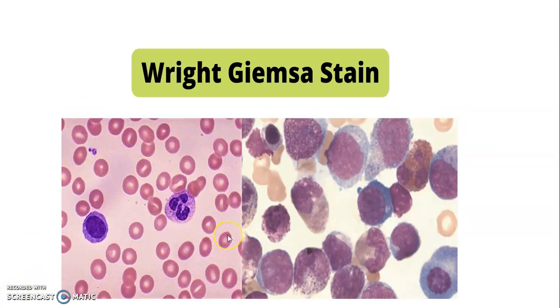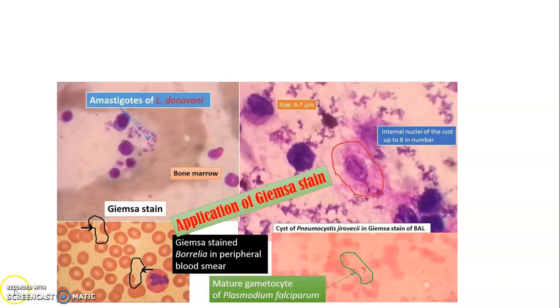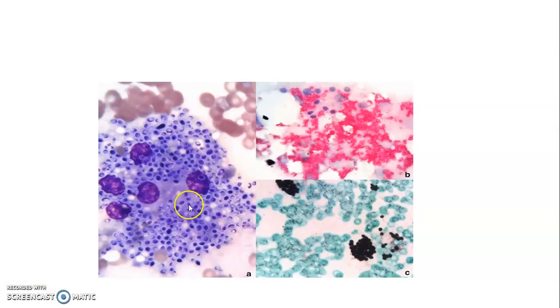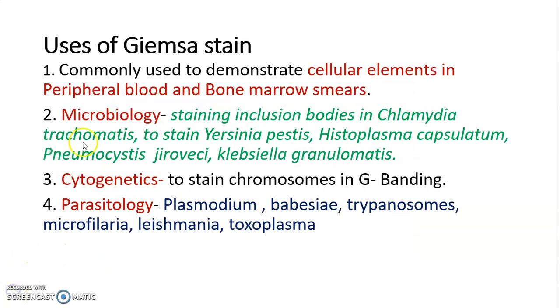Photographs shown here demonstrate Giemsa staining for detection of cellular elements in peripheral blood film and bone marrow. Giemsa stain showing Leishmania donovani, internal nuclei of cysts, Borrelia, and Plasmodium falciparum. These images also show Leishmania donovani with kinetoplasts, and Histoplasma capsulatum. This concludes the discussion on Giemsa stain. Thank you.